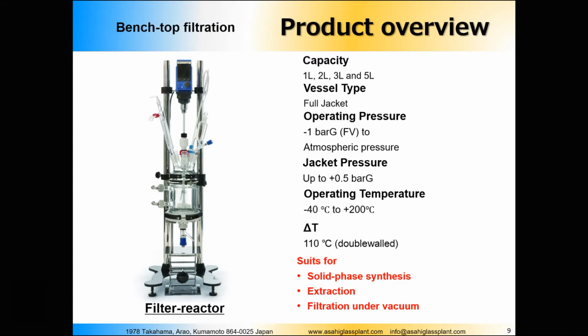Because the heat transfer coefficient for the glass is very small. So when we pour hot water into the glass, one side of the glass, which is now washed with the boiling water, starts to expand very quickly.